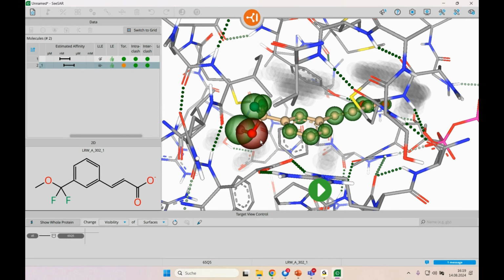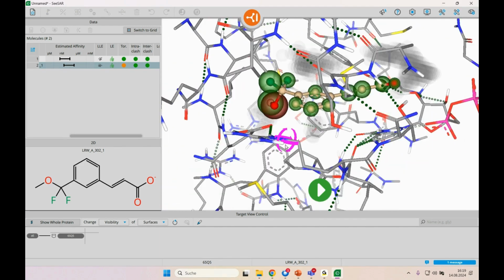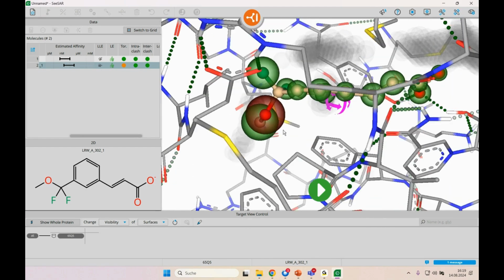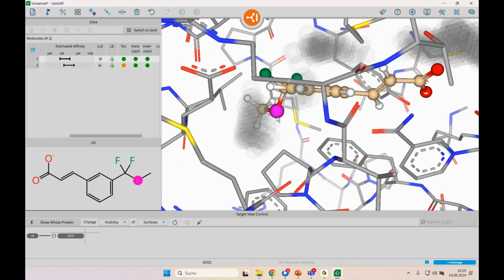But it seems like oxygen was a bad call. It doesn't work. It's not a surprise to be absolutely fair, because there are absolutely no valid H-bond interaction partners for the oxygen. Yeah, it was worth a try. Okay, let's try sulfur maybe. Sulfur is obviously bigger, and it's also more lipophilic.